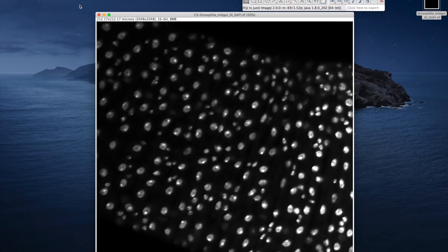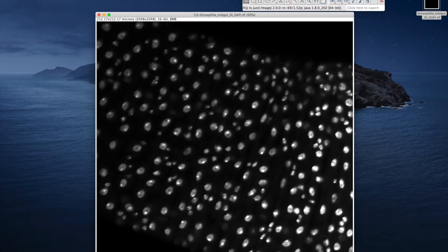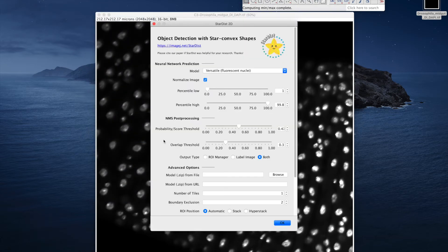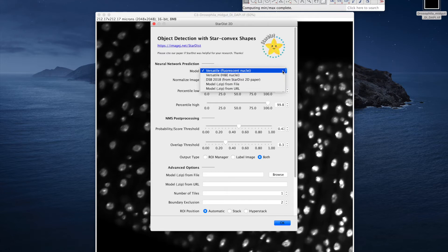And then go to Plugins and select the StarDist 2D. Here we can see a list of available pre-trained models.